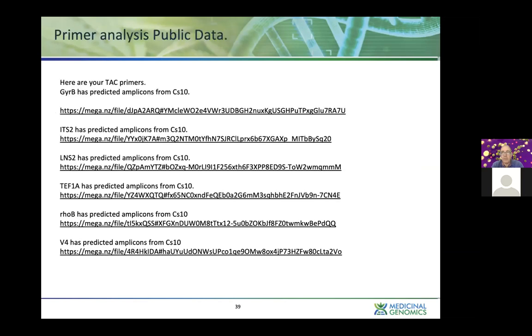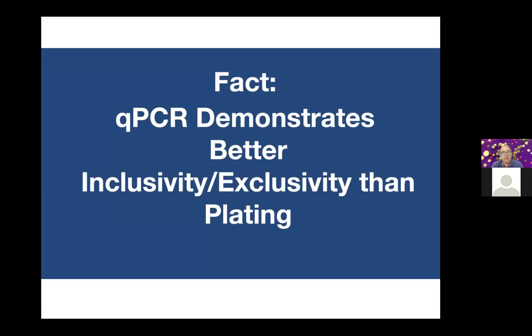We've put all the primer alignments here public. People can download these. We realigned them actually to CS10, which is the genome that we didn't assemble. So an independent party assembled that genome. So perhaps it's less biased than taking a genome that we put public.